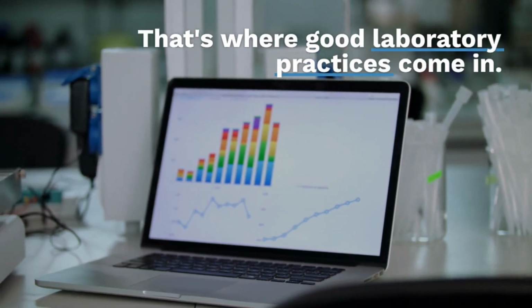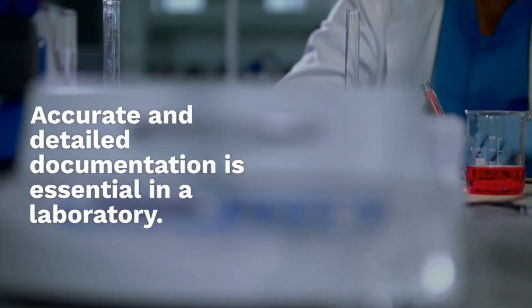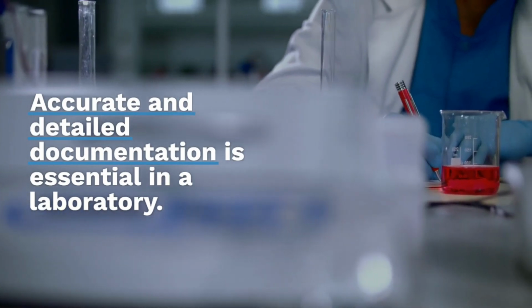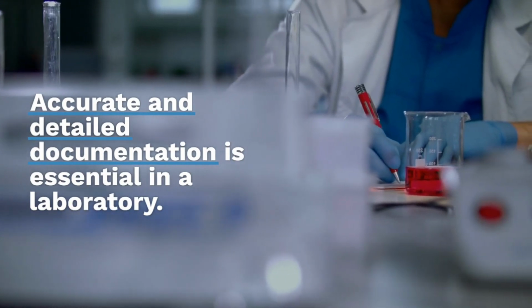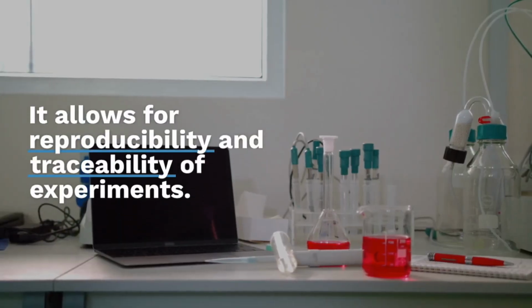1. Documentation and record keeping. Accurate and detailed documentation is essential in a laboratory. All experimental procedures, observations, measurements, and results should be properly recorded in a laboratory notebook or electronic database. This documentation allows for reproducibility and traceability of experiments.